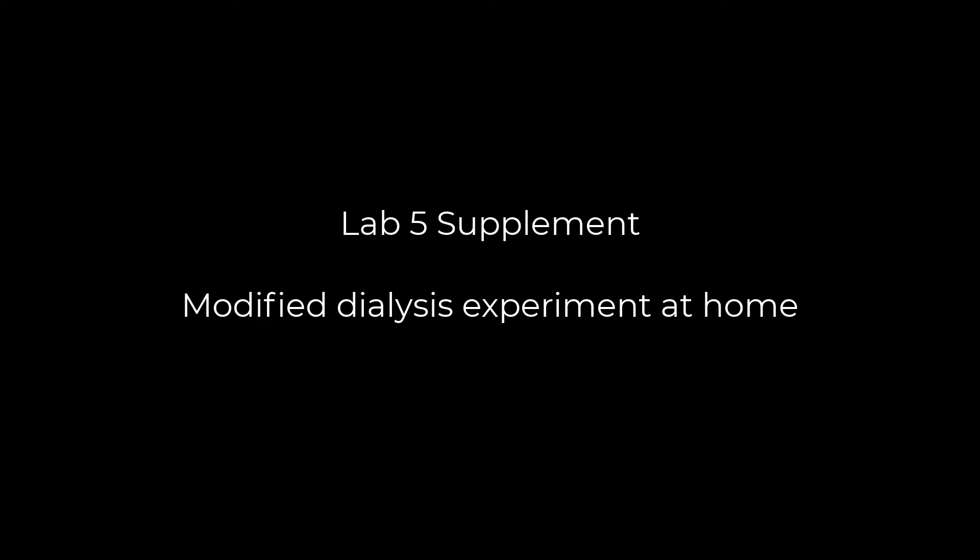This video will instruct you on how to perform a modified version of the dialysis experiment similar to the one that was conducted in the lab 5 video.